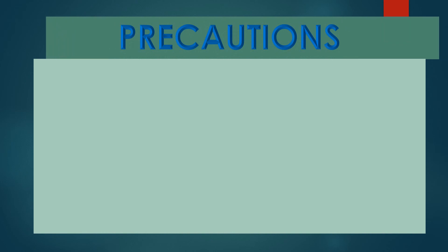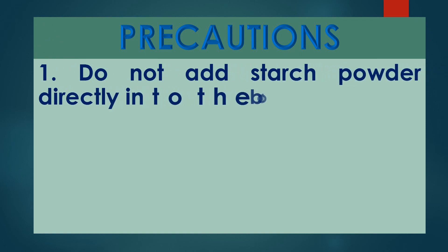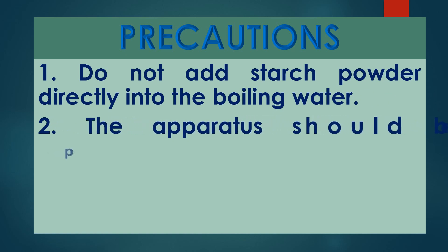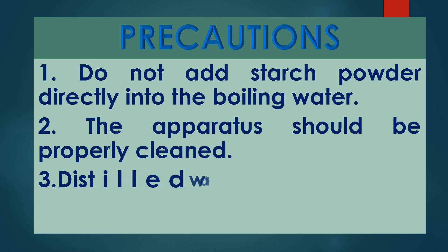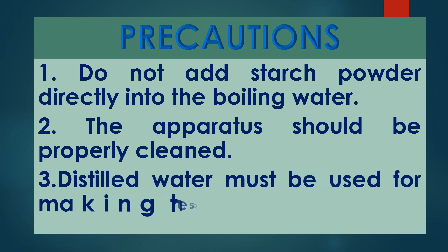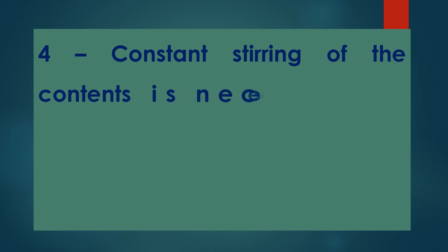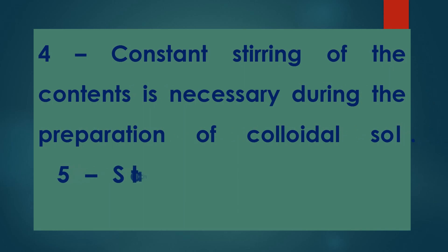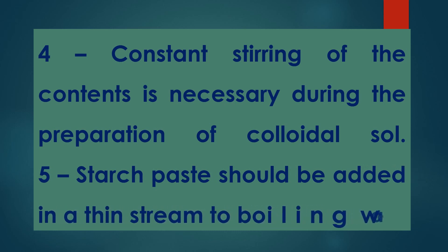Precautions: do not add starch powder directly into the boiling water. The apparatus should be properly cleaned. Distilled water must be used for making the sol. Constant stirring of the contents is necessary during the preparation of the colloidal sol. Starch paste should be added in a thin stream to the boiling water.